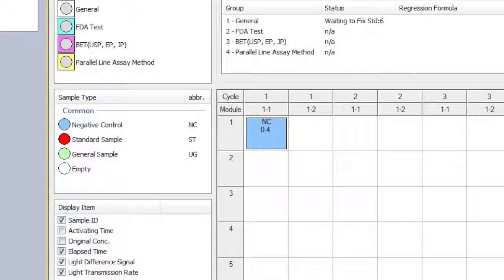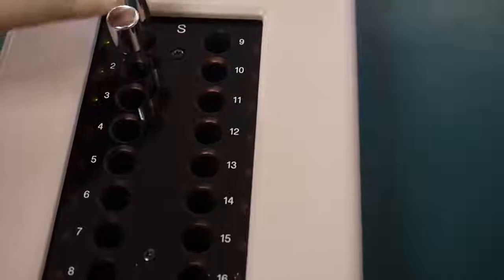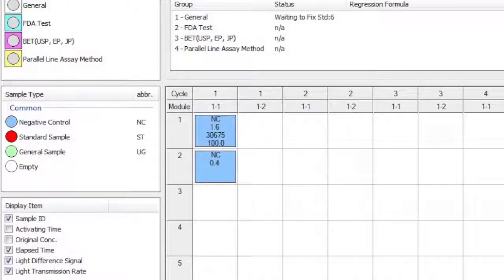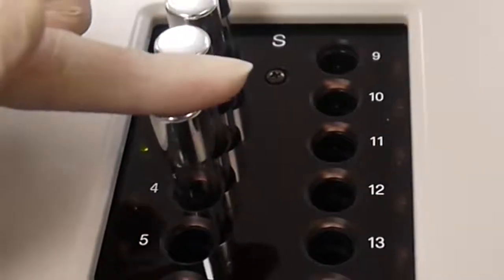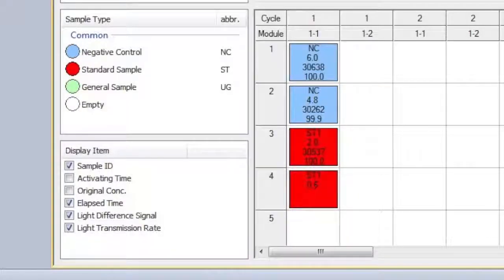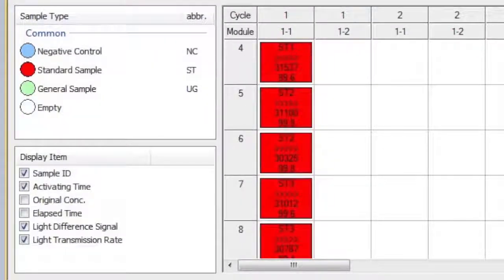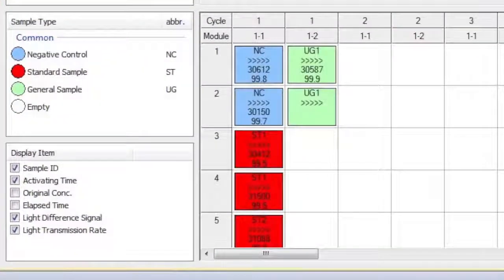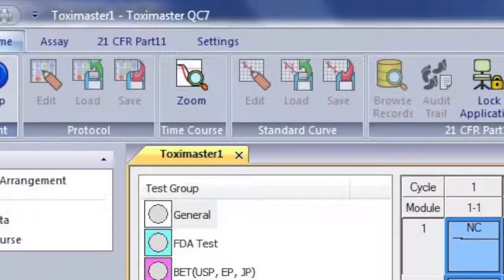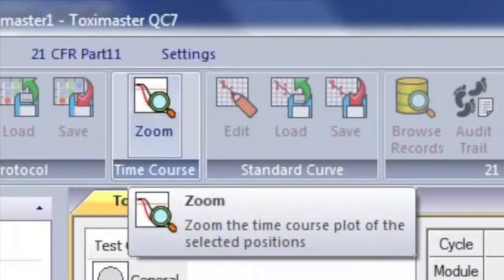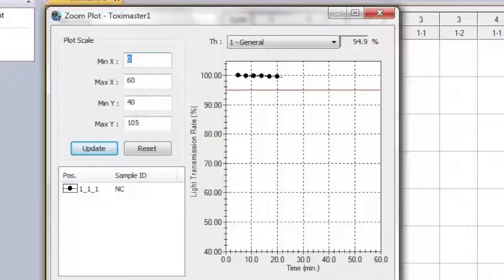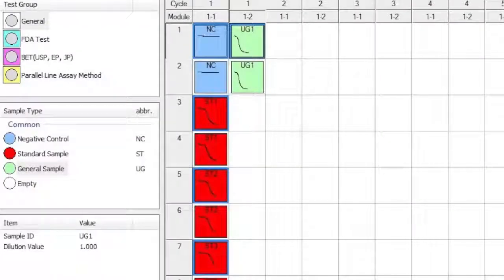You will now see the sample in position 1 begin to generate data. The data for position 2 will now begin to generate. As each reaction tube is placed within the toxinometer, the data can then be found in the Toximaster program. During our testing cycle, there are many options to view the data the Toximaster QC7 software produces. Using your mouse to select a sample, you can then select Zoom above the Time Course option and see the plot of the sample selected. The same option is available when selecting multiple samples.